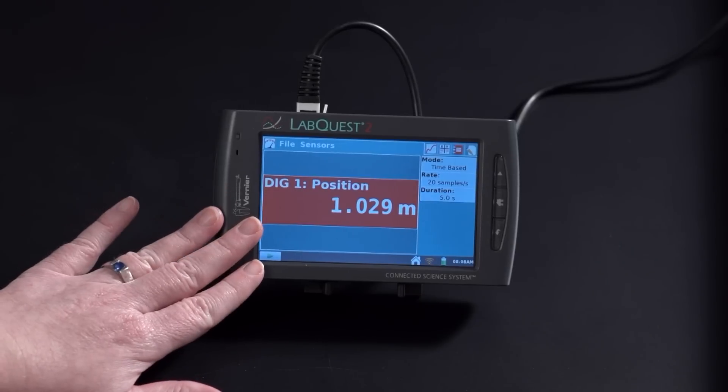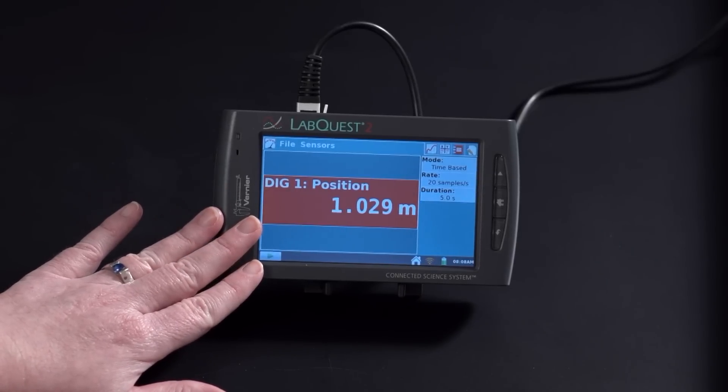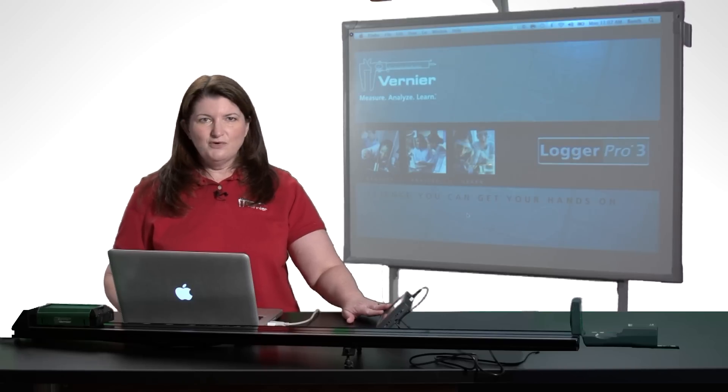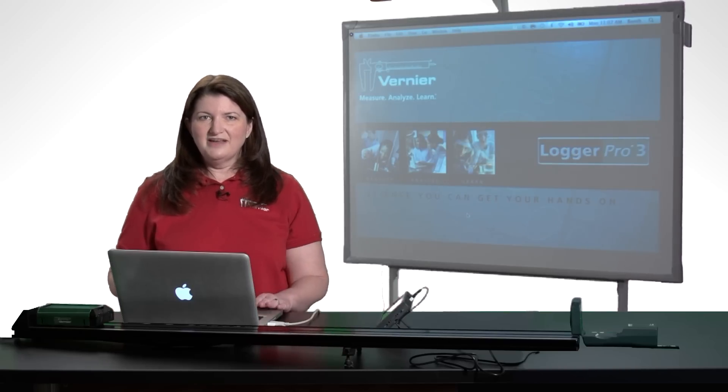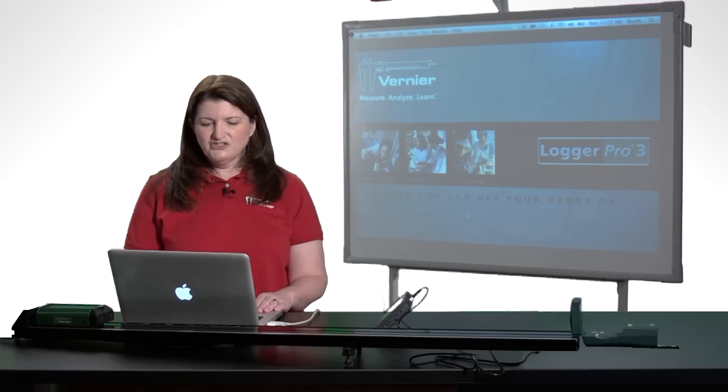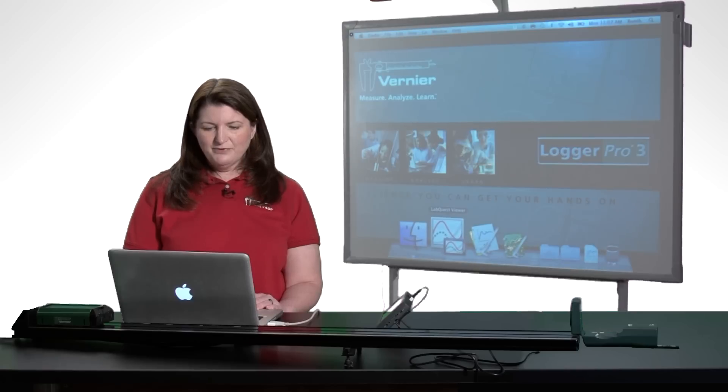Today I have a LabQuest 2 so I'm going to be connecting through wireless connectivity. Right now I have this LabQuest connected to the same Wi-Fi network as my computer, so I'll go to the computer and launch my LabQuest Viewer software.